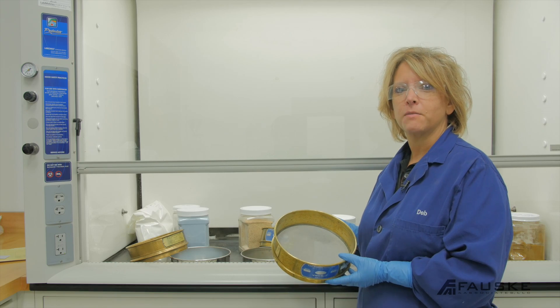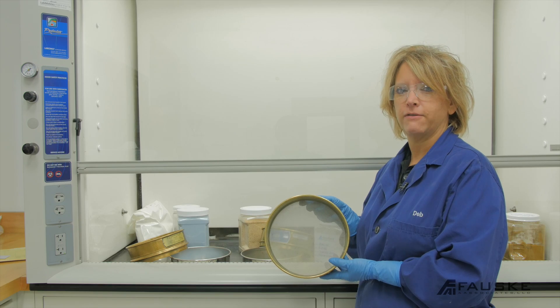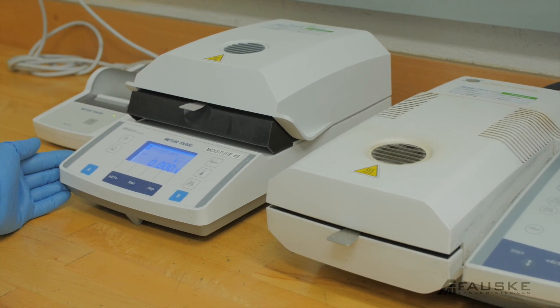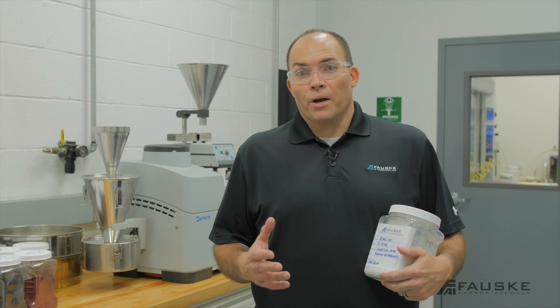We can prep your material in a number of different ways, one of which is sieving through this 200 mesh screen to achieve your minus 75 micron. We can grind it. We also check the moisture content of the material. ASTM recommends testing at less than 5%.